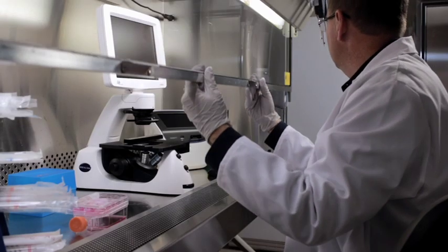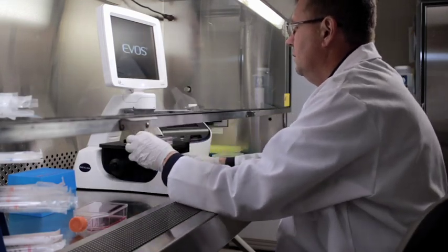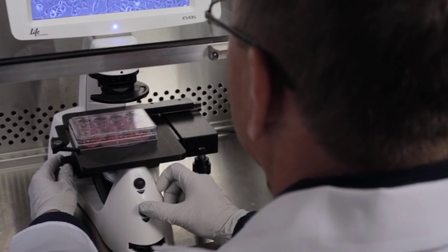Since it can be placed either in a cell culture hood or on a bench right next to an incubator, the EVOS XL Core imaging system is designed to be a perfect complement for working in the cell culture room.